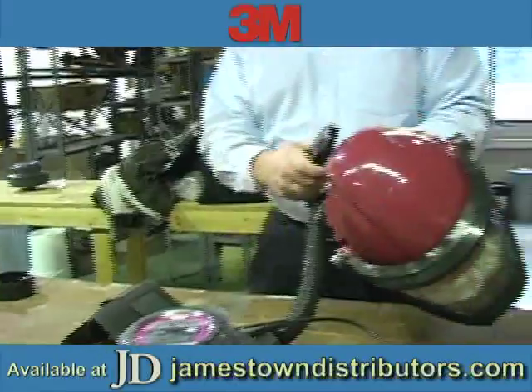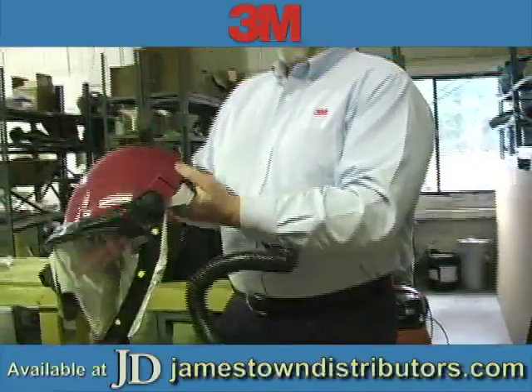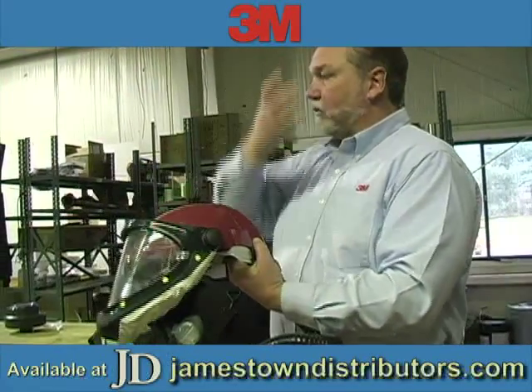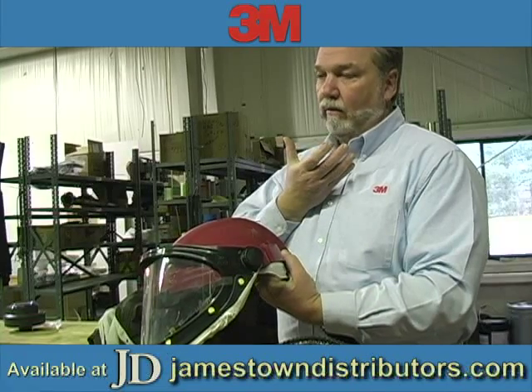The hose is in turn attached to the back of the helmet. The air is delivered up and over the top of the head and actually provides a curtain of air over the face of the wearer.